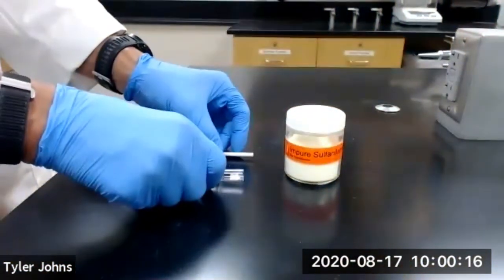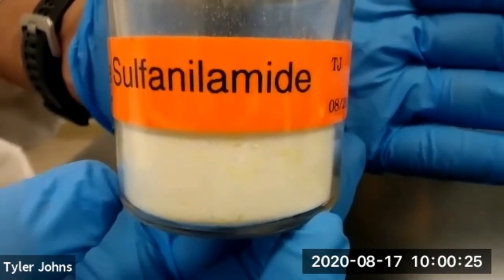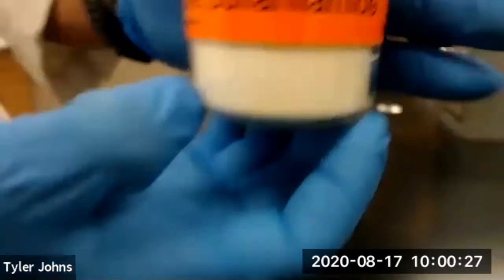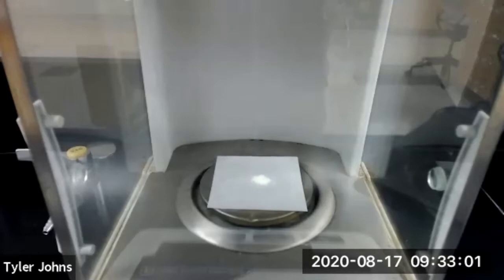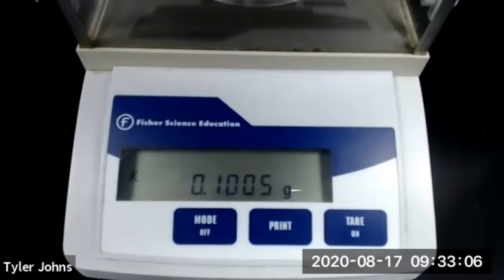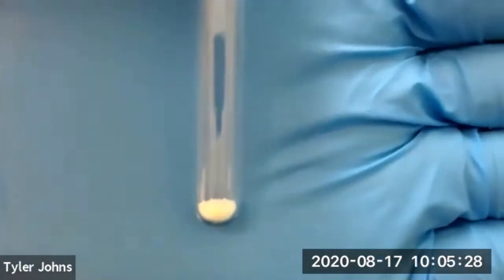We need to weigh out approximately 100 milligrams of our impure sulfanilamide. Note the color of the impure sulfanilamide and transfer that approximately 100 milligrams to our Craig tube. The mass of impure sulfanilamide that we will be adding to our Craig tube is 0.1005 grams.